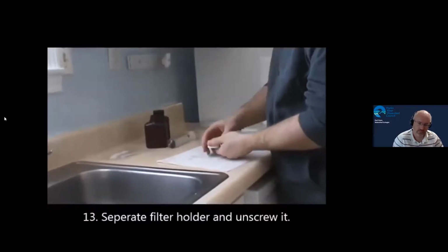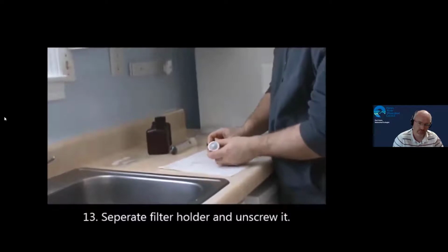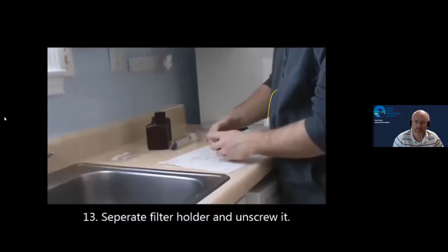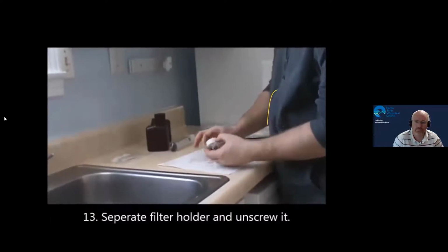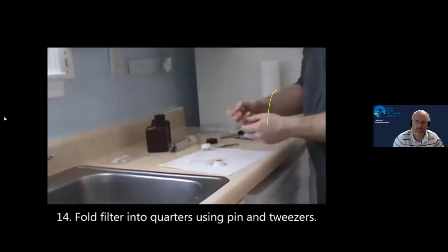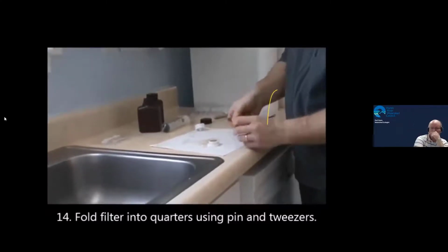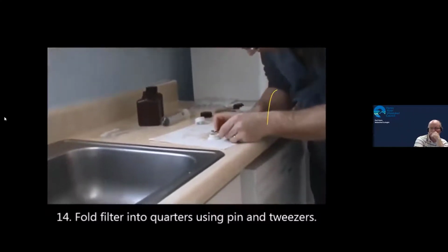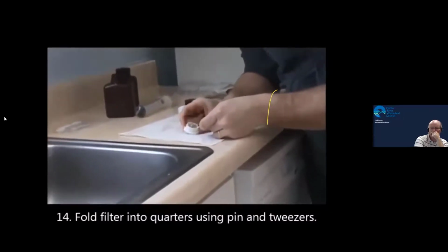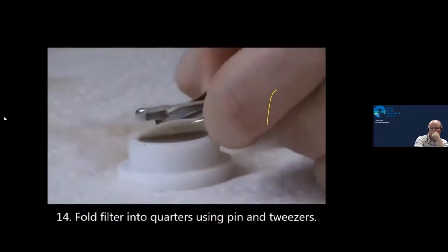After filtering the water, separate the filter holder from the syringe and unscrew it. Using a safety pin and tweezers, fold the filter in quarters with the algae on the inside. The filter will probably stick a bit to the filter holder, and it requires a steady hand and some practice to do this job smoothly. Remember, never touch the filter with your fingers.